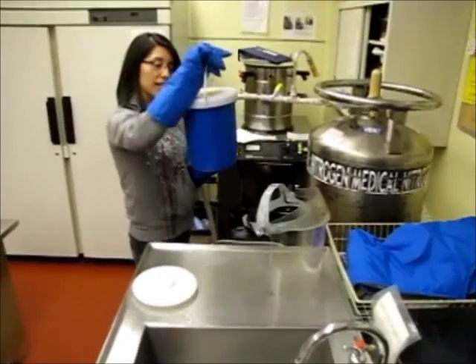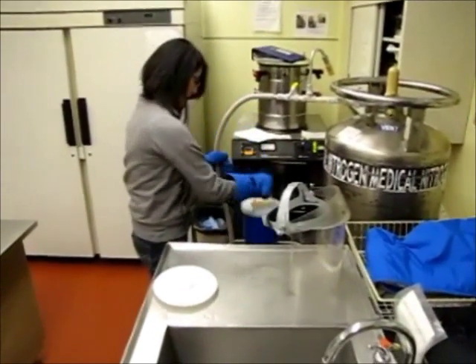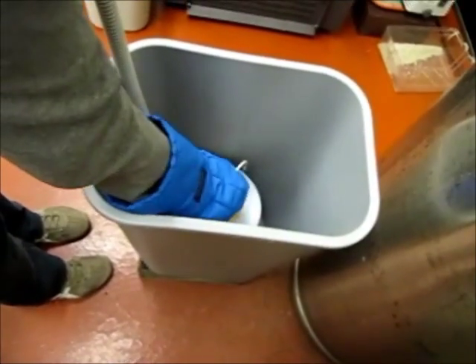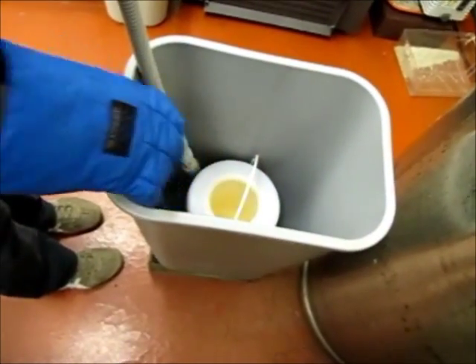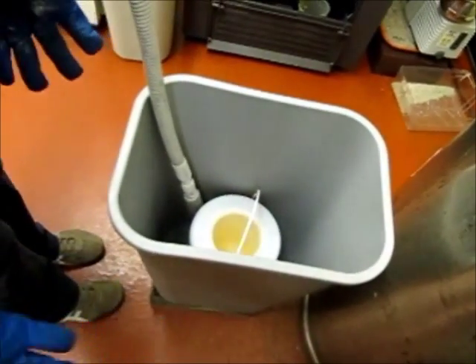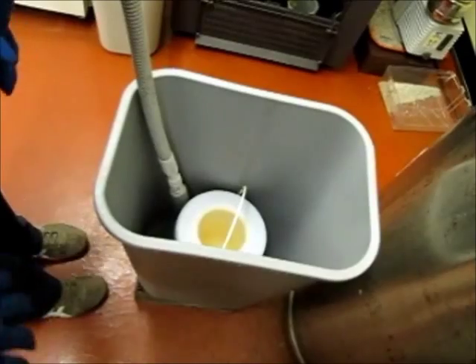Make sure to place your container inside the bin, because sometimes this nozzle can be left open and it will overflow. So you don't want it on your shoes.